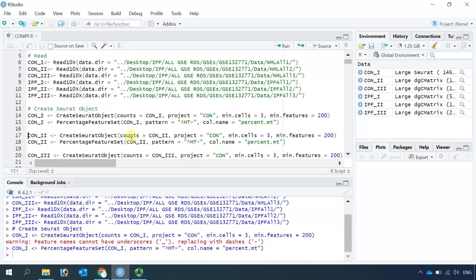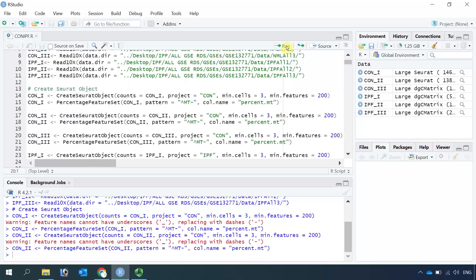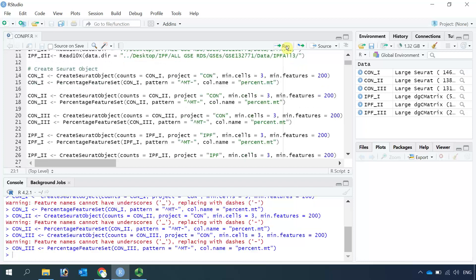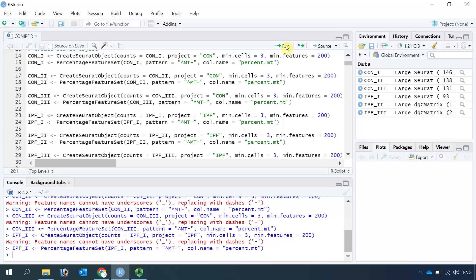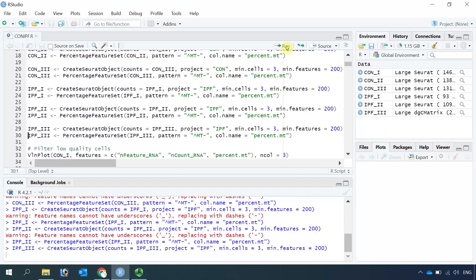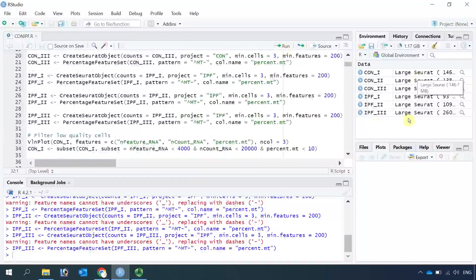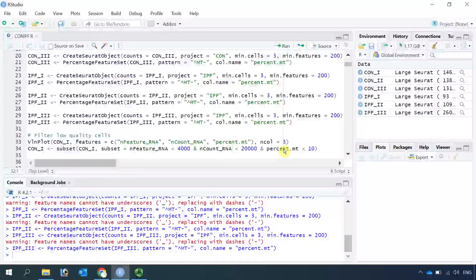We can repeat both steps to create a Seurat object for ctrl2, ctrl3, ipf1, ipf2, and ipf3. You can see now we have six Seurat objects. Next we can filter out the low quality cells.